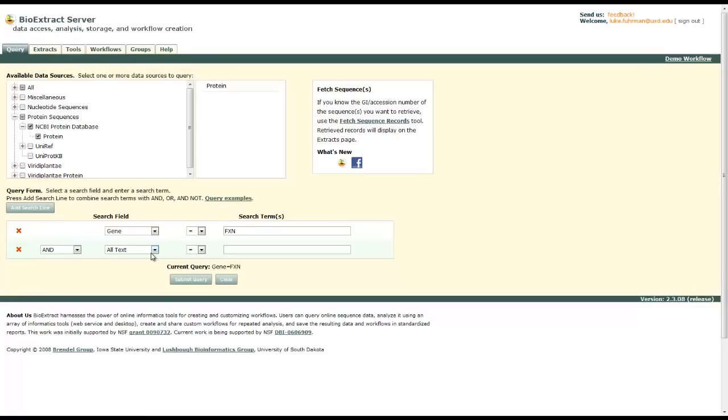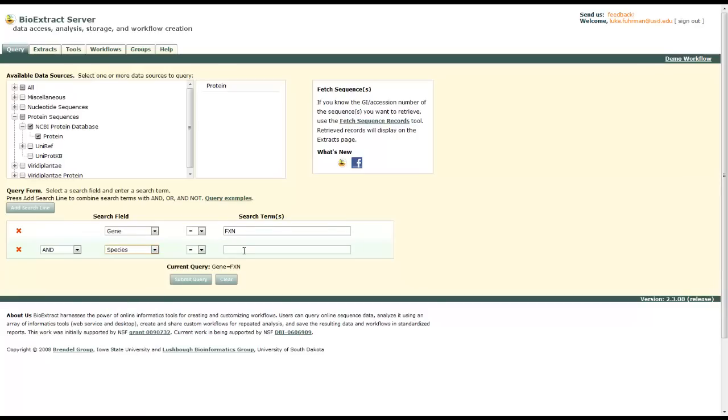In this one, define species and human. And then let's search our query.